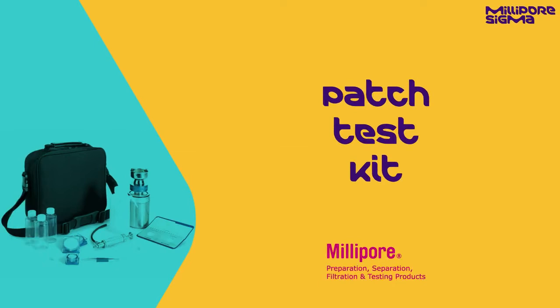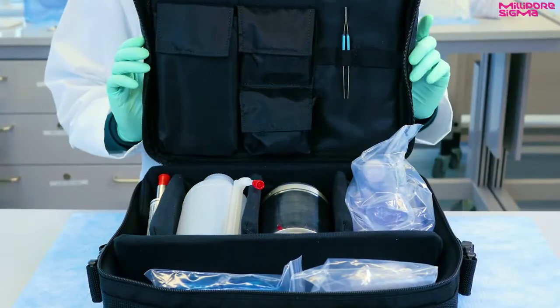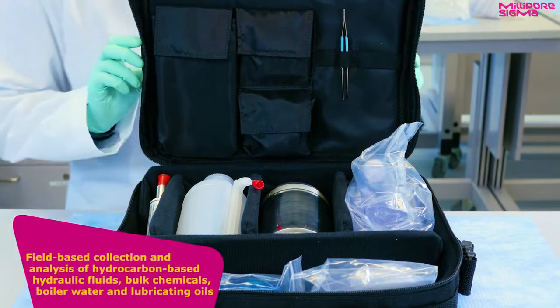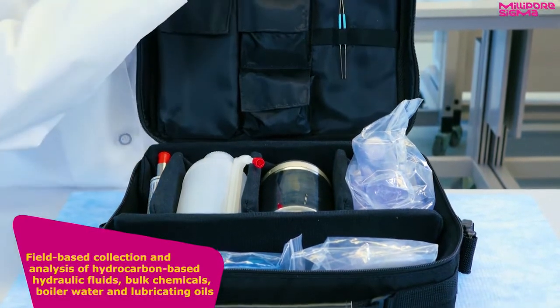This is the Industrial Patch Test Kit, a complete solution for field-based collection and analysis of hydrocarbon-based hydraulic fluids, bulk chemicals, boiler water, and lubricating oils.